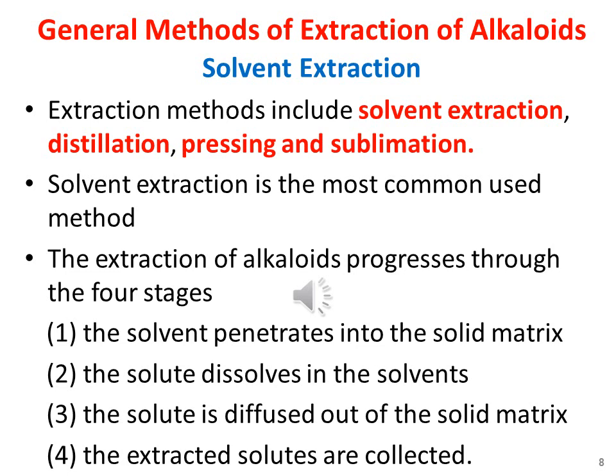High temperature increases the solubility and the diffusion. Temperature that is too high, however, may cause the solvent to be lost, leading to the extraction of undesirable impurities and decomposition of thermolabile components. The extraction efficiency increases with the increase in the extraction duration in a certain time range. Increasing time will not affect the extraction after the equilibrium of the solute is reached inside and outside the solid material.